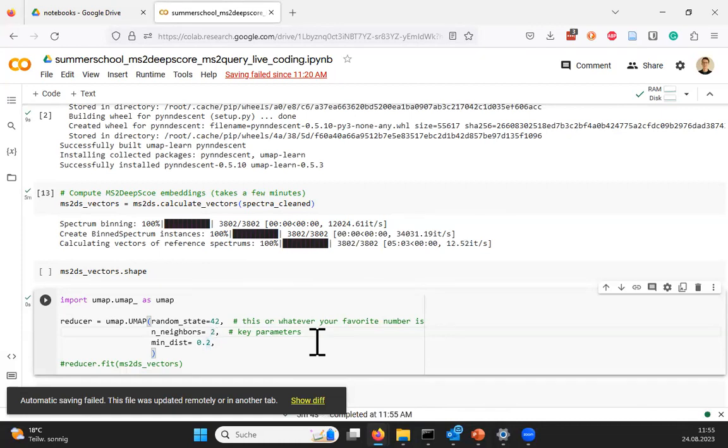We now come to a big problem in this field: there's hardly a way to judge how good your data dimensionality reduction works. So it's up to you to visually inspect how it works. I would recommend setting neighbors to a higher number, like 20 for a start, and the distance anything like 0.2, 0.25, 0.3, 0.4 is fine. So I set it to 20. You can look it up, I think there's a link in there. The higher this value is, the more you look into global patterns, and the lower it is, the more you look into local patterns.